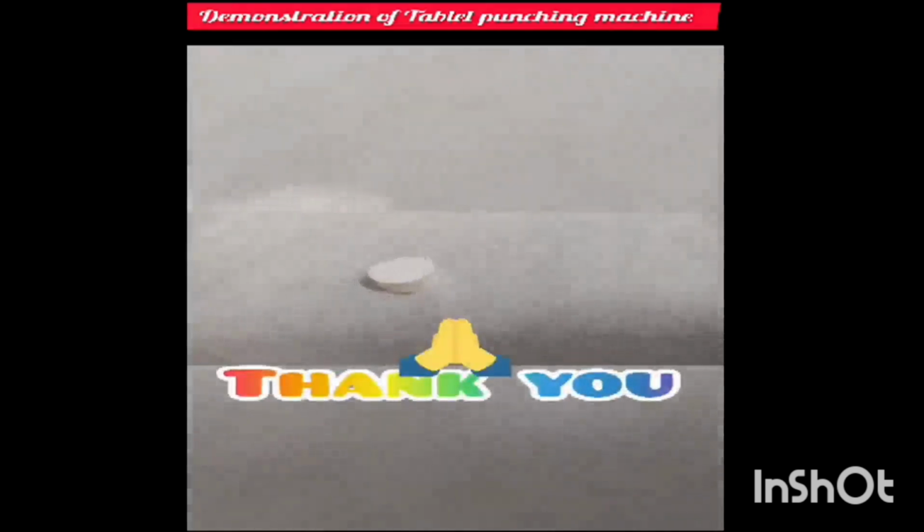You can see this is one of the sample tablets prepared by the 8-station tablet punching machine, and it got successfully ejected without breaking. Hope you will find the video very interesting and informative.